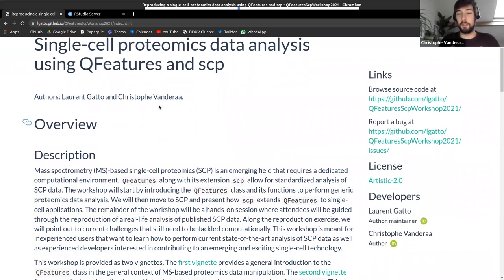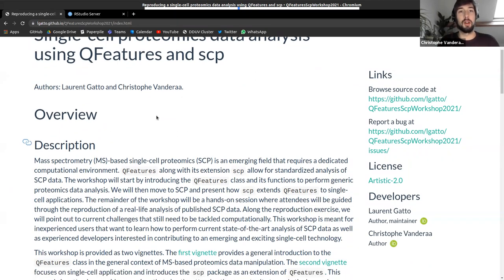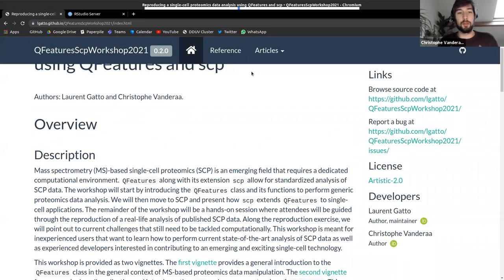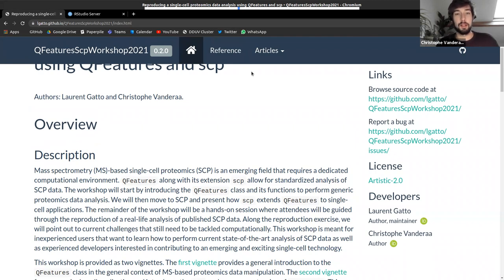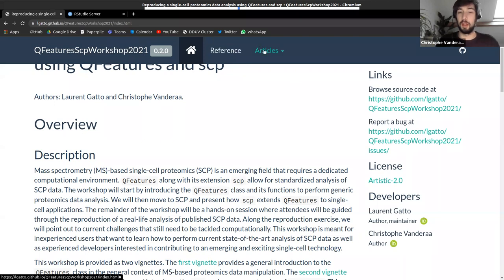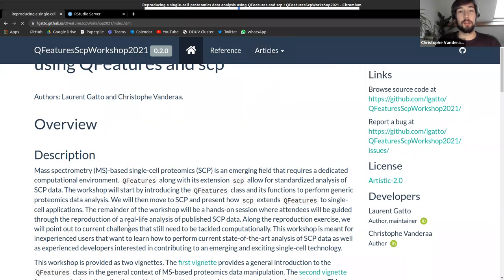This workshop was originally intended as a one-and-a-half hour workshop, so don't worry if I skip some parts. It's split into two parts: first, an introduction to QFeatures — a package for manipulating and visualizing mass spectrometry-based proteomics data — and second, a more focused section on single cell proteomics applications using QFeatures, including reproducing an existing workflow with our software.